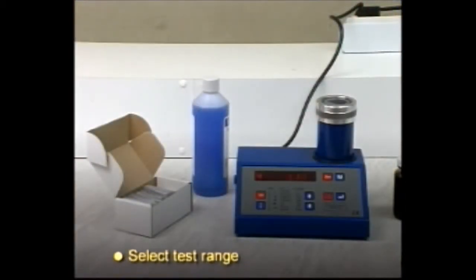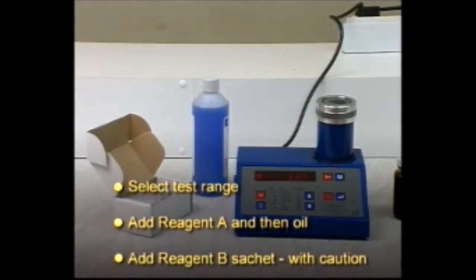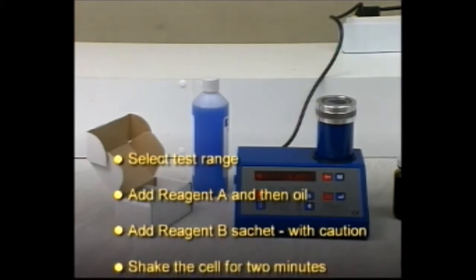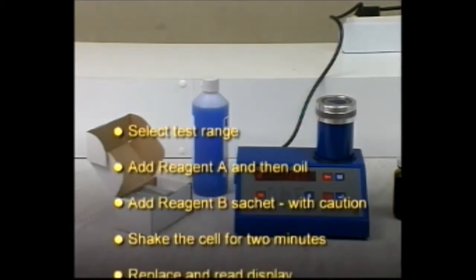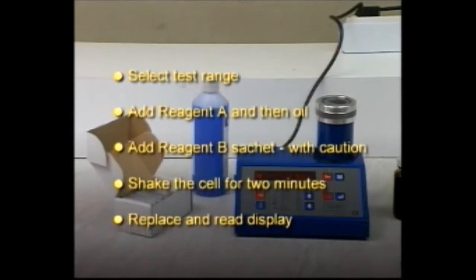To summarize: select test range, add reagent A and then oil, add reagent B sachet with caution, shake the cell for 2 minutes, replace and read display.